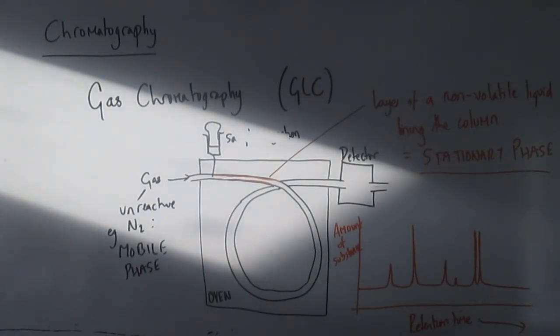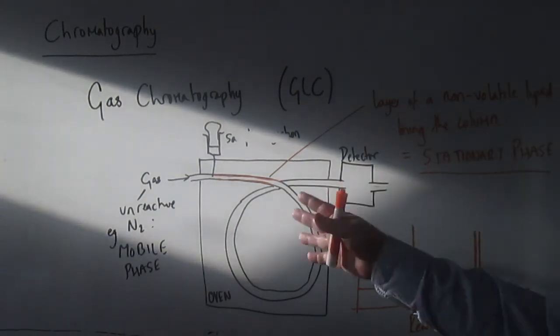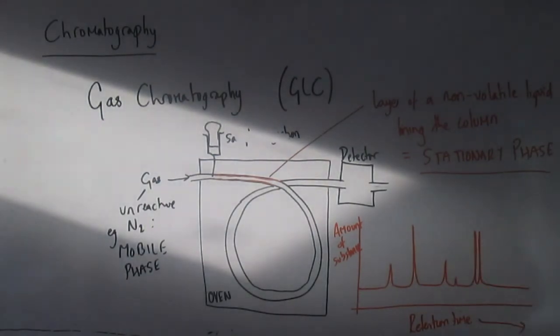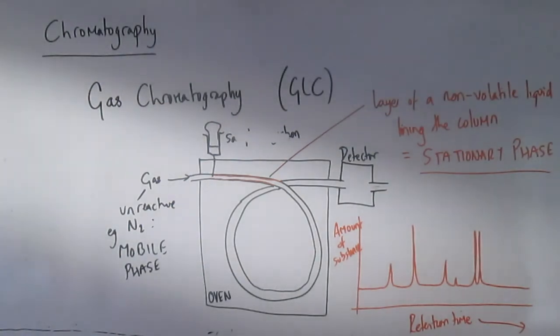So it's a much more powerful method, but it comes at a price. A TLC plate costs a few pennies. A gas chromatography setup costs thousands of pounds. So you invest in this when you need it, when you have to be able to analyse complex mixtures.